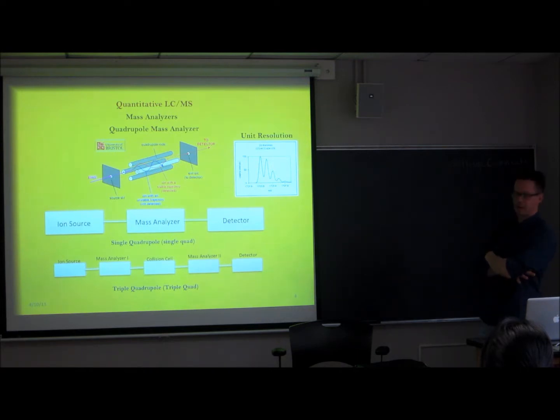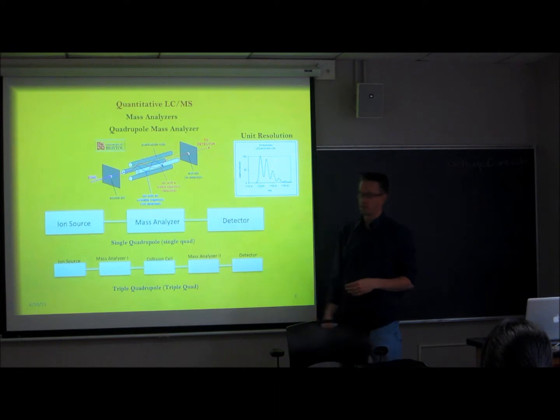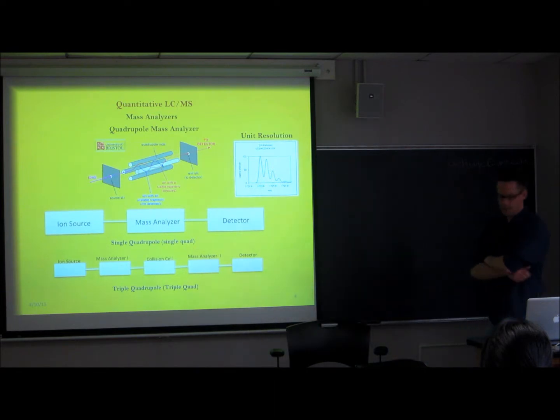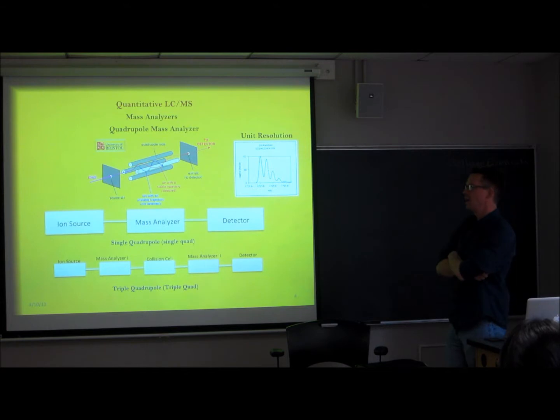You're going to be able to measure that area very accurately and do accurate quantitation as a result. So for the examples we're going to talk about today, I'm going to focus on using a dual mass analyzer or a triple quadrupole mass spectrometer at the back end of whatever chromatography system you might be using, in which case we've got our ionization source.